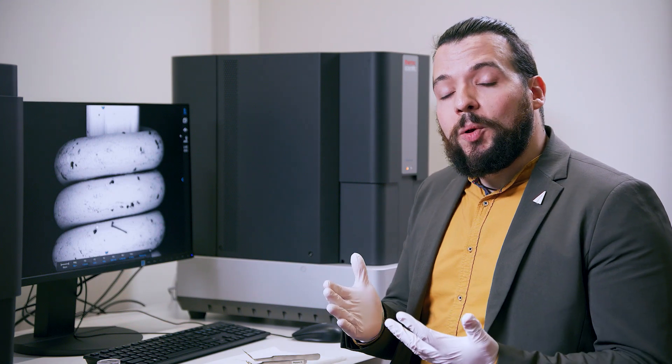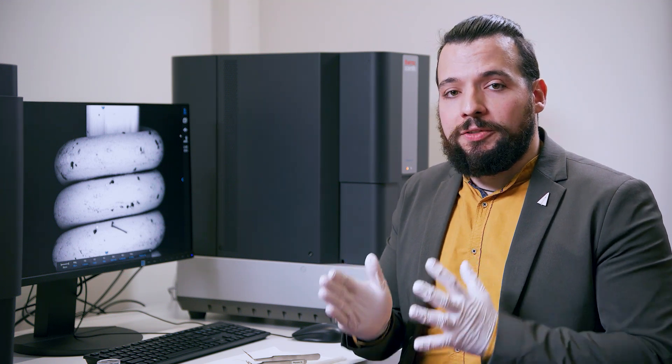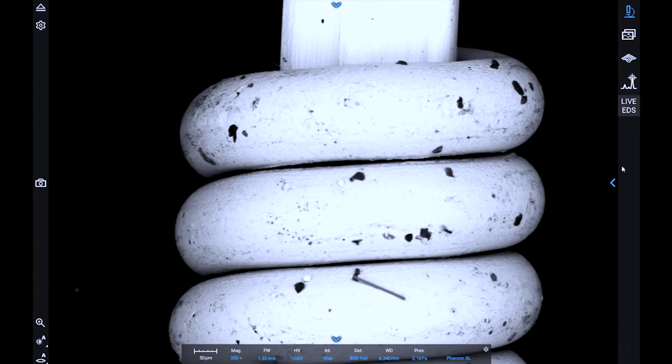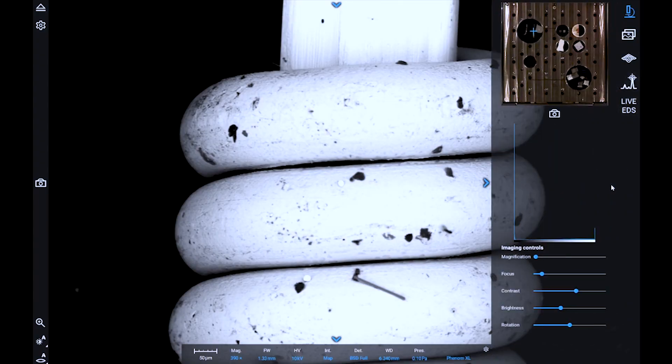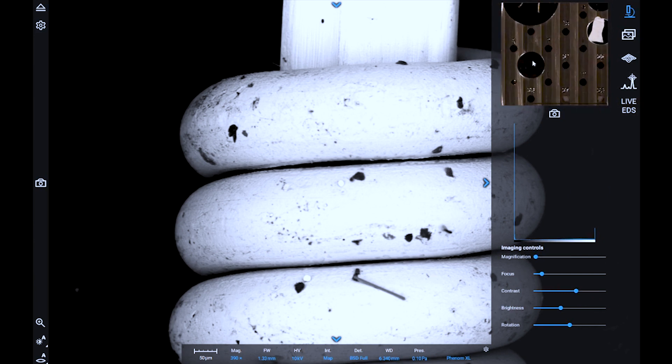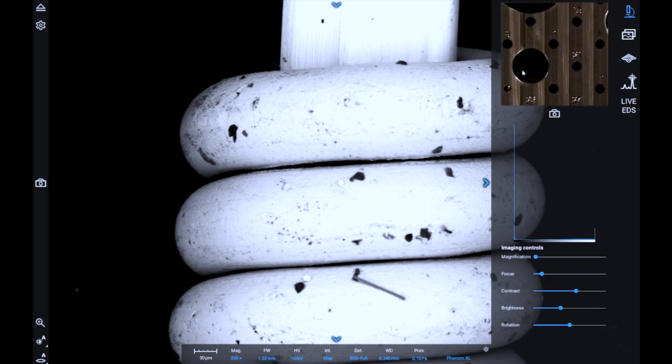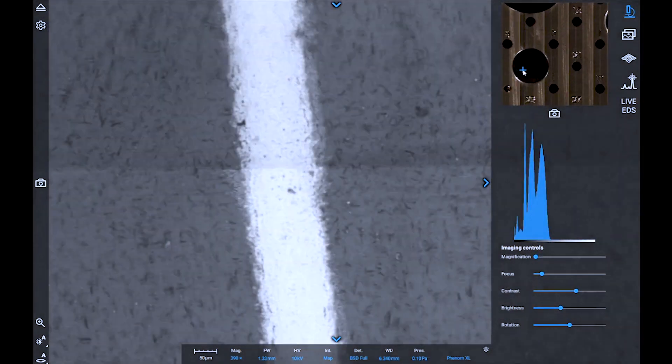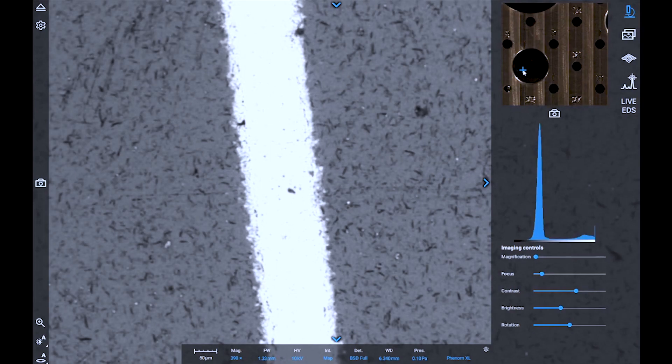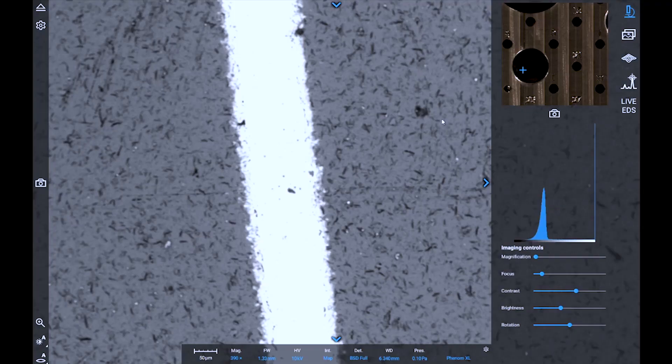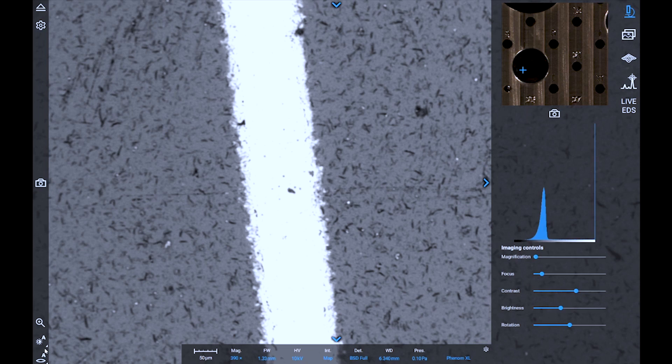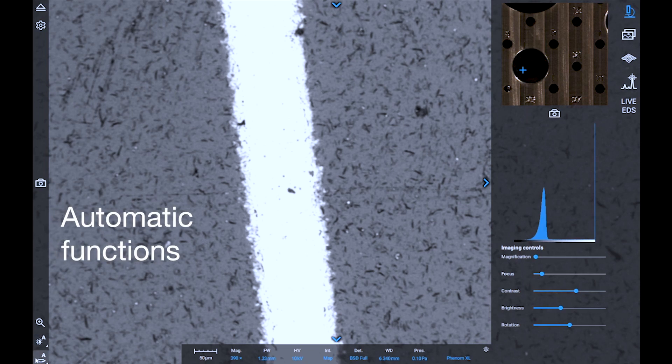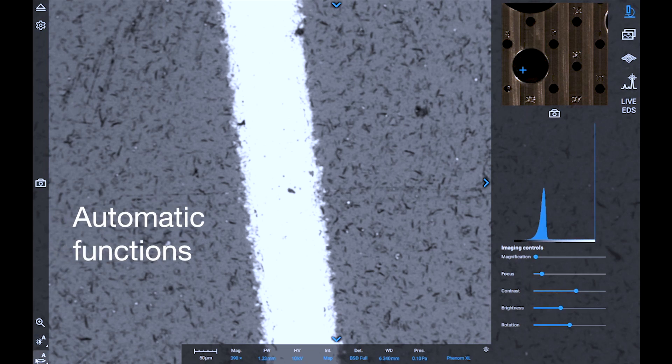Whenever you're done analyzing the first sample, you can use the optical image that we acquired before to quickly move to a different position. We can show the image again by clicking on the arrow on the right side of the screen, and then we can zoom in the optical image and select the position that we want to move to. The stage will then be moved so that we can start imaging the new sample, and we can quickly adjust contrast and brightness with the automated function that we find on the left side of the screen.